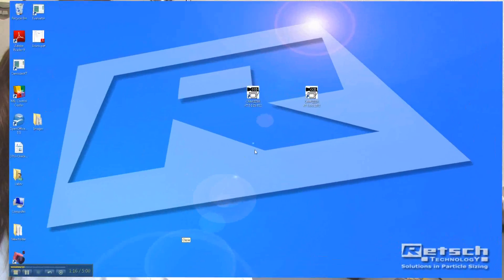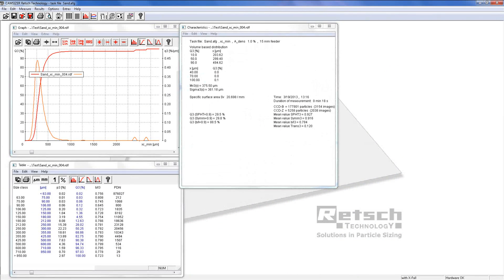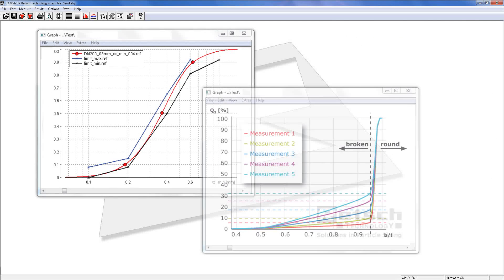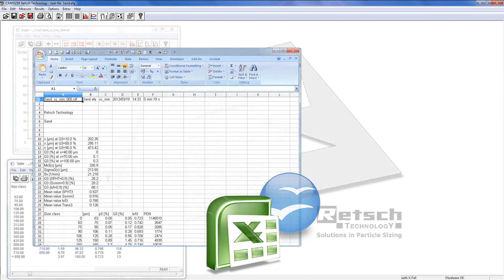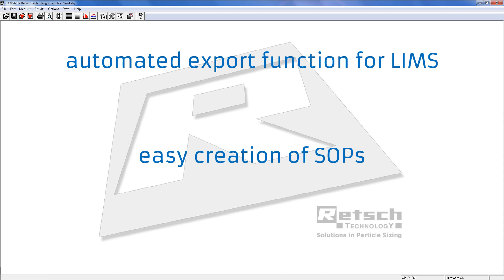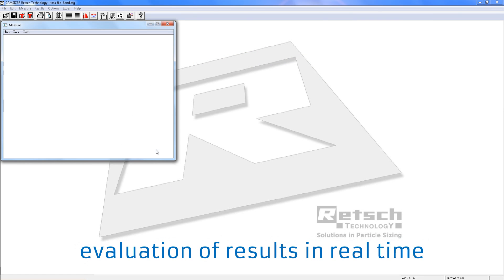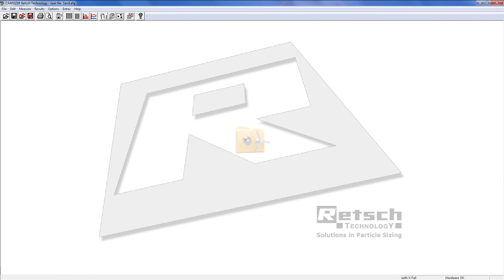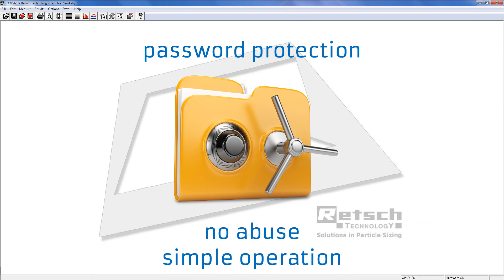RECH Technology supplies the CamSizer XT complete with a well-thought-out and powerful control analysis software. All measured results can be displayed and processed in various ways with the application-oriented program. It provides information on over- or undersized particles, agglomerates, or shape of the particles. Data can be displayed in tables or charts and exported in established file formats like Microsoft Excel. Automated export of data for laboratory information management systems is possible, supporting the easy creation of standard operating procedures. An essential advantage is the evaluation of results in real time, with graphical representations available even during measurement. Furthermore, password protection makes chosen and stored parameters inaccessible for unauthorized persons, avoiding abuse of the system and keeping its operation as simple as possible.